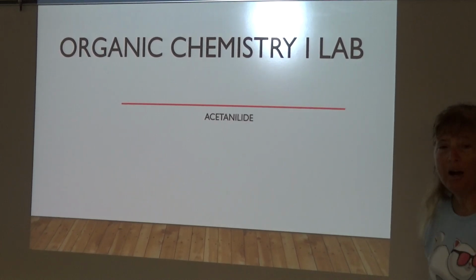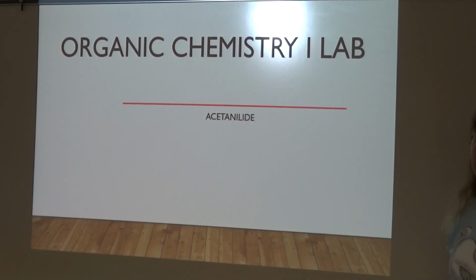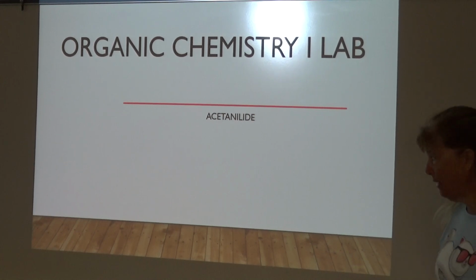Welcome to week 1 of remote teaching in Organic Chemistry 1 lab. Today we're going to go through acetanilide, the production of. It is an amidation reaction, that is, we're creating a new amide bond between what was a carboxyl carbon and a nitrogen.